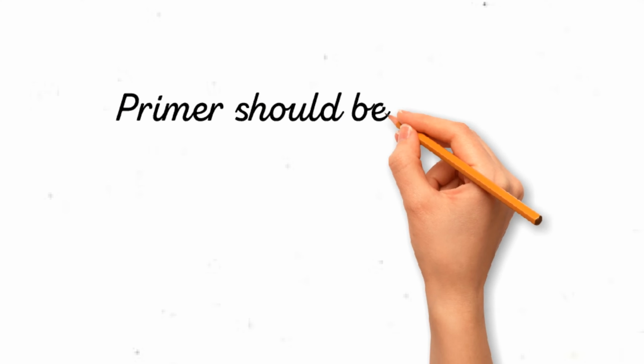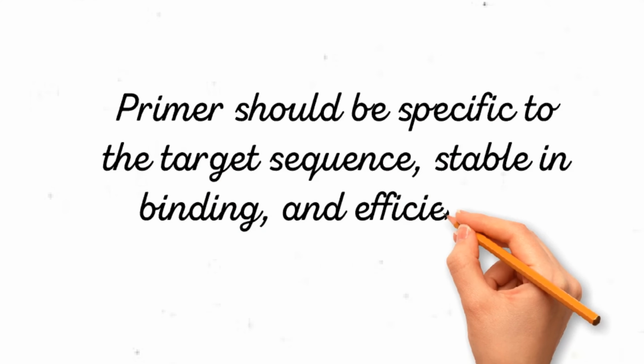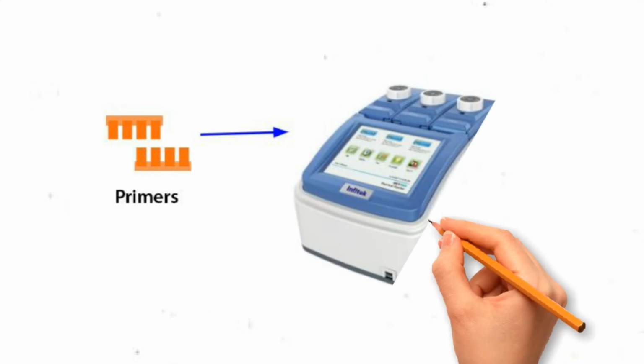To wrap up, a well-designed primer should be specific to the target sequence, stable in binding, and efficient for amplification. With these basics and the right tools, you're ready to start designing primers for your experiment.